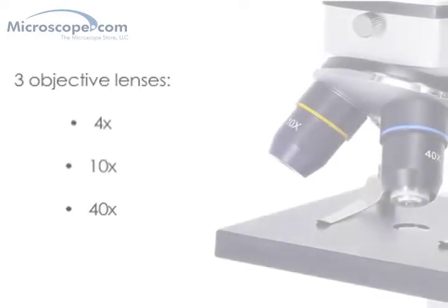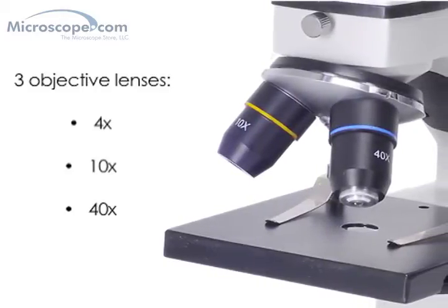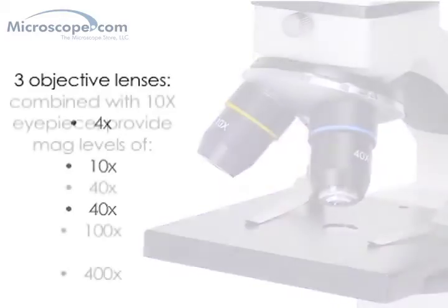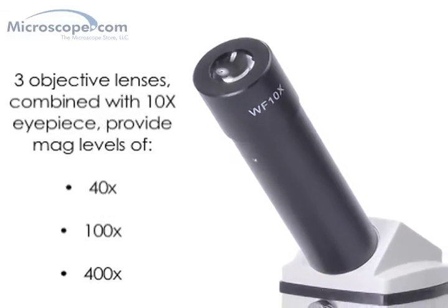The optics include three objective lenses at 4x, 10x, and 40x powers, which combine with the supplied wide-field 10x eyepieces to provide 40x, 100x, and 400x magnifications.